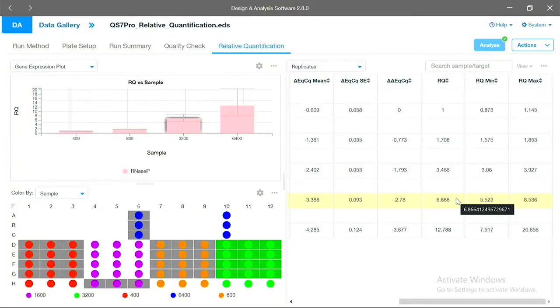So again, the hard part's actually getting the information into the software, not necessarily getting plots out of the software. And honestly, the most physically demanding is setting up the plates. But is it really that hard? And you can always ask Molly to do it for you. And then intellectually, what should take the most time, in my mind, is picking the assays and doing your upfront work to make sure you are getting high quality data before you even set foot in the lab. There is no excuse in my mind for that.